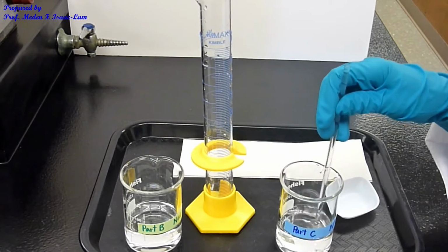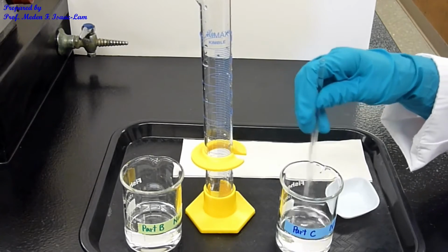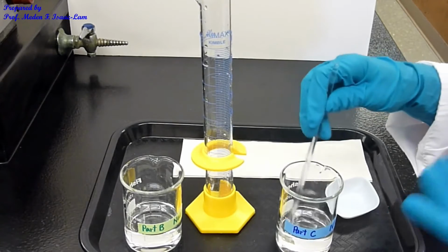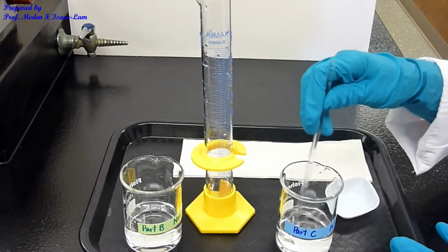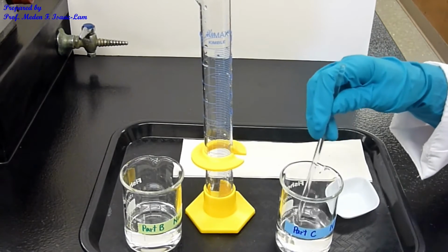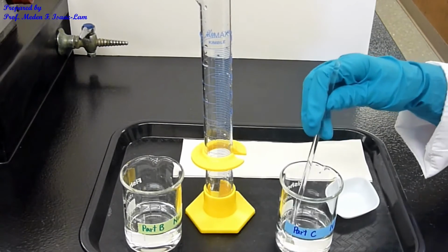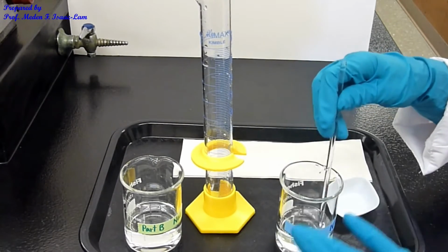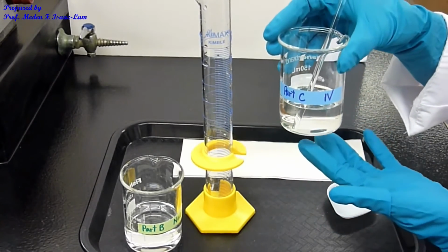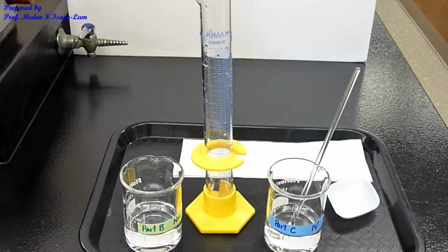So you can see that it actually became clear. I still see some specks at the bottom, so I want to dissolve completely. So once you make the solution, the solute seems to disappear, right? So you don't see any layer again, it's homogeneous. You don't see separation of the layer. It's completely like water. So you will not be able to determine what's in the water because it's clear. Okay? So that is your IV, injectable IV. And it's clear solution. Alright? So that is basically your part C.